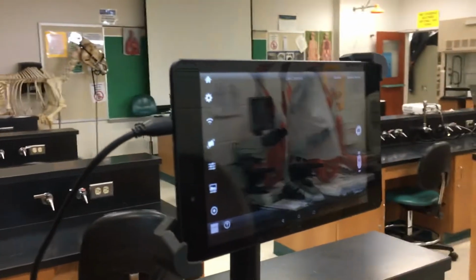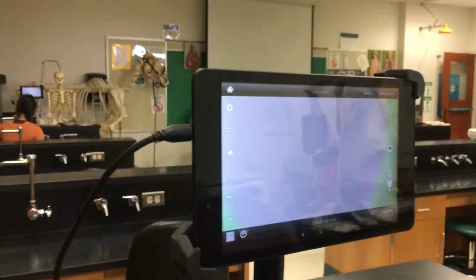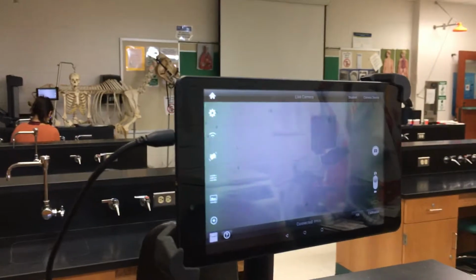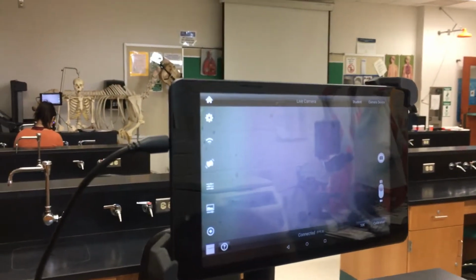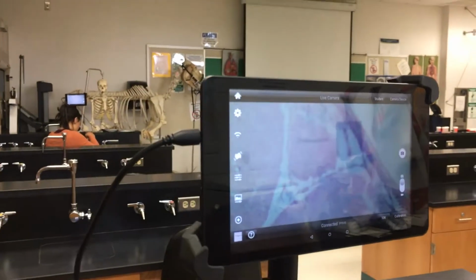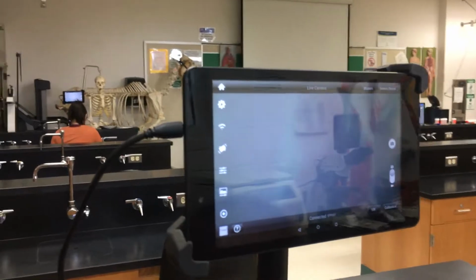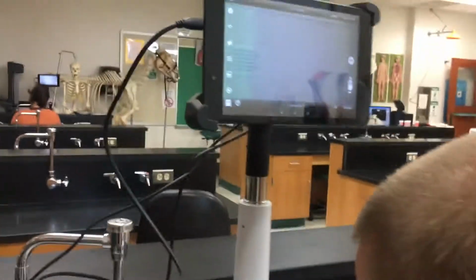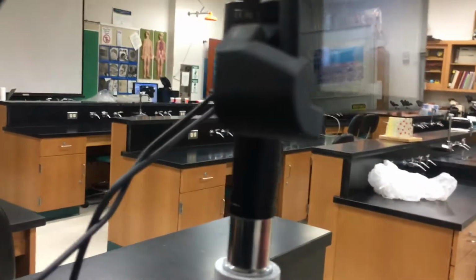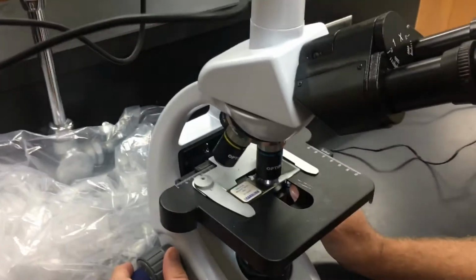Let me zoom out one more time and see what this whole thing looks like, because it can tell us a little bit about what that was. Oh, you just want to know if it's an intestine or... Right, if it's an intestine or something like that. So I'm going to zoom in. And I'm also looking for whether it's a transverse section or a longitudinal section. It should say on the slide. That would make it easier, but oftentimes they don't say it, particularly these types of slides.